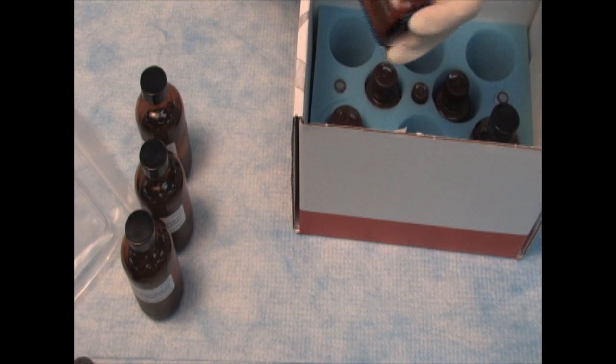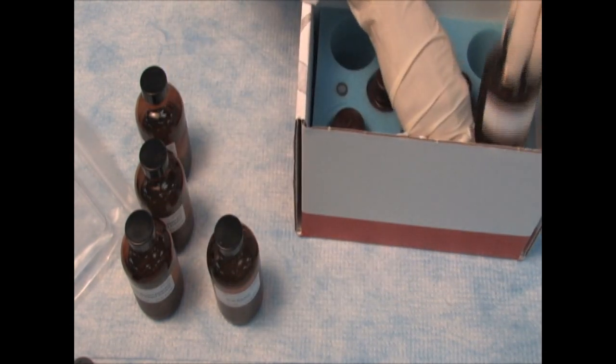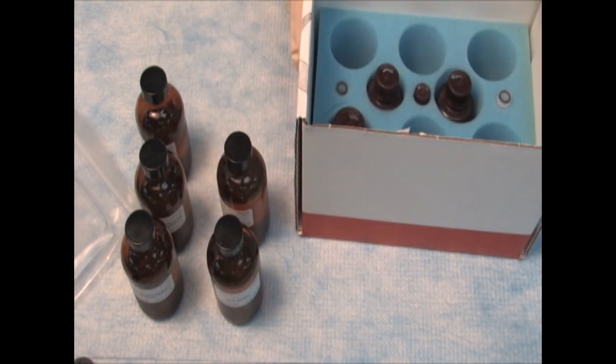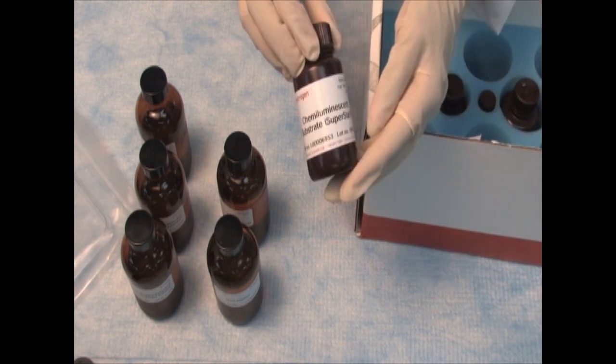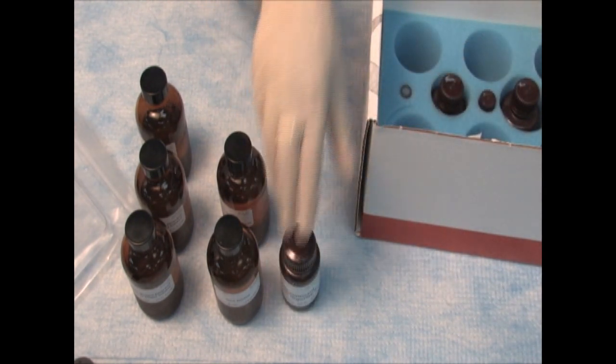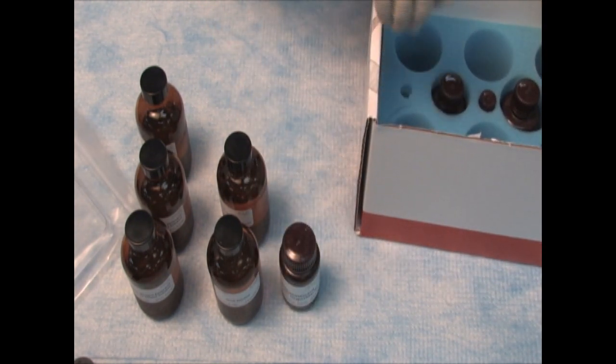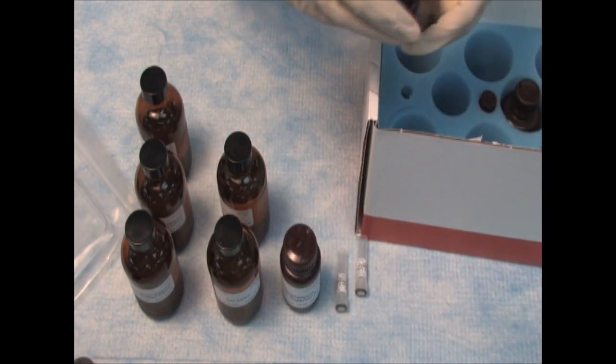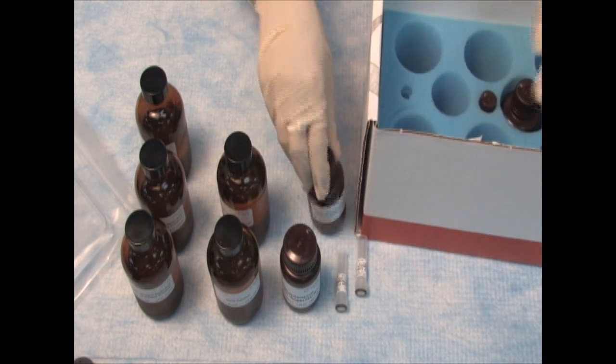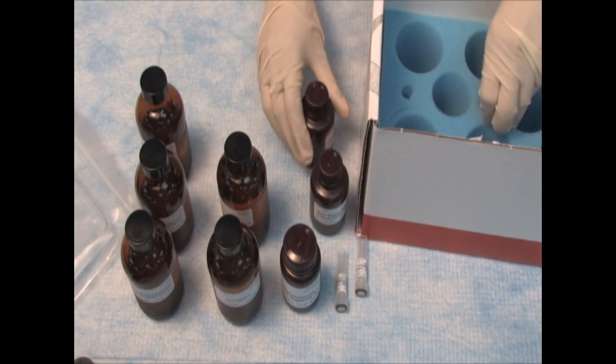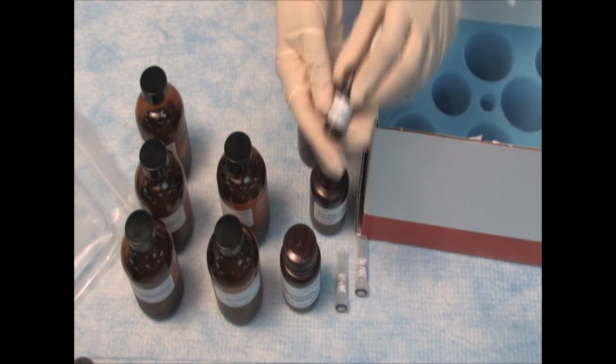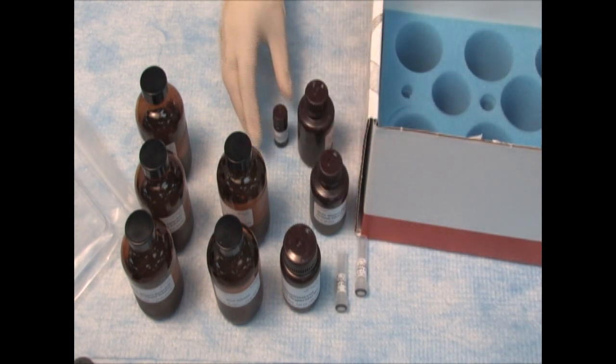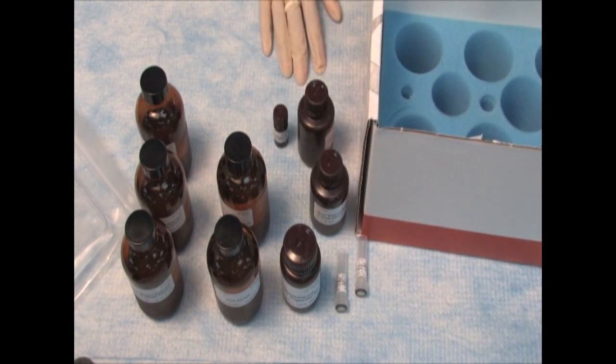We have some wash solutions, a couple of bottles of those. And then we have a substrate, this is the chemiluminescent kit, so we get a chemiluminescent substrate. We have two tubes of secondary antibody. We have an antibody diluent additive. And then we have the substrate enhancer. So really everything you need to get your Western signal.